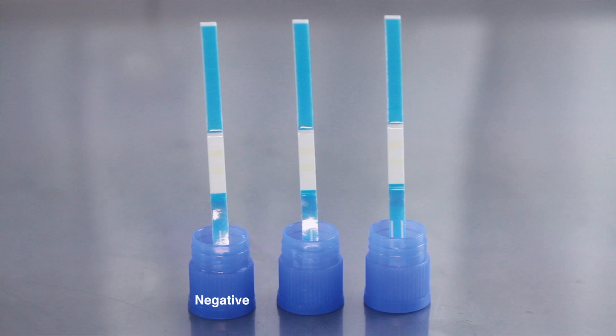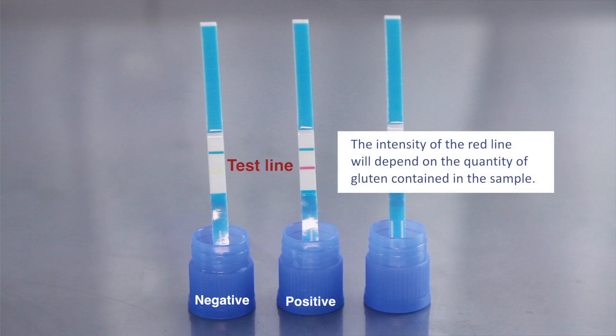For a negative result, a single blue line or control line appears in the central part of the test. For a positive result, a red line will appear below the blue control line.